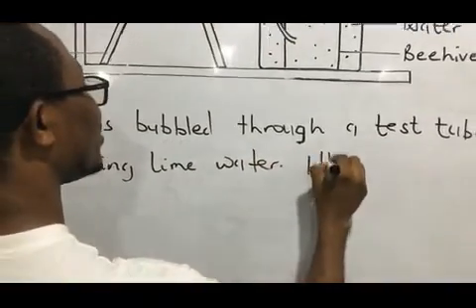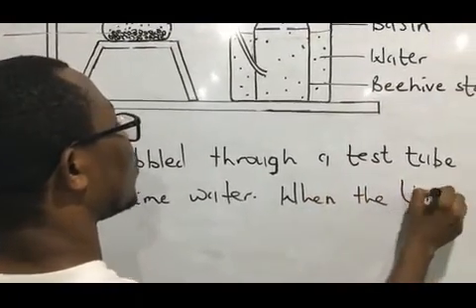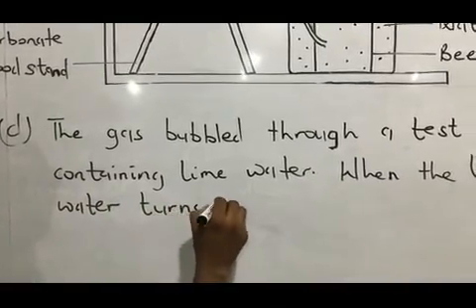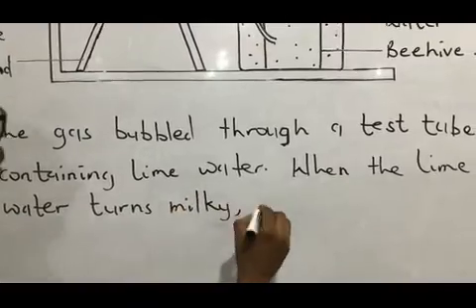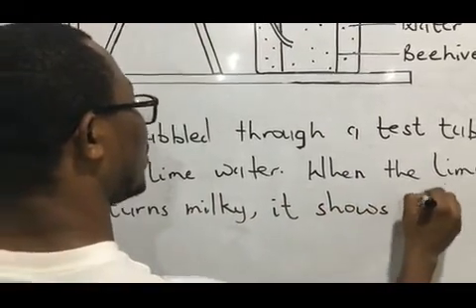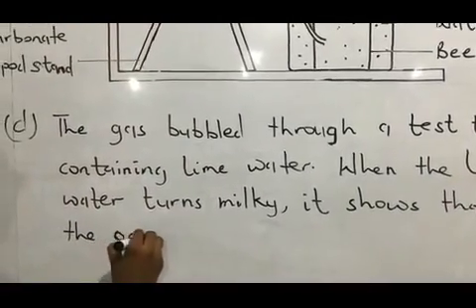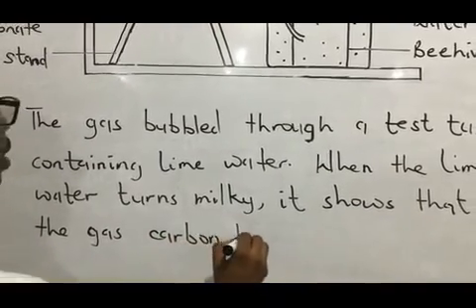When the lime water turns milky, it shows that the gas is carbon dioxide gas.